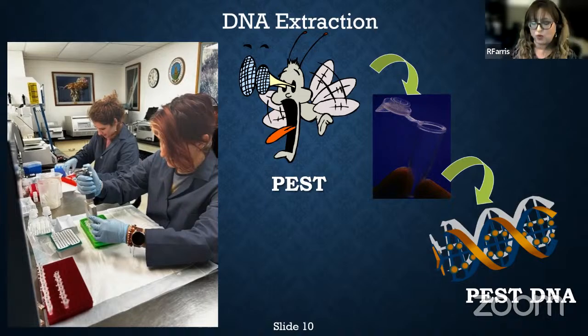There are some more steps that we need to do to get to the point where we get to DNA. And we use what are called DNA extraction kits at our lab. And it's basically a kit where you're applying different chemicals and reagents to the squished insect and taking it through a series of centrifuging steps, which is spinning and collecting reagent, maybe spinning again. And there's some filters in some of these tubes that's collecting things that are important. And sometimes you're getting rid of things you don't want. So there's a combination of these sorts of steps.